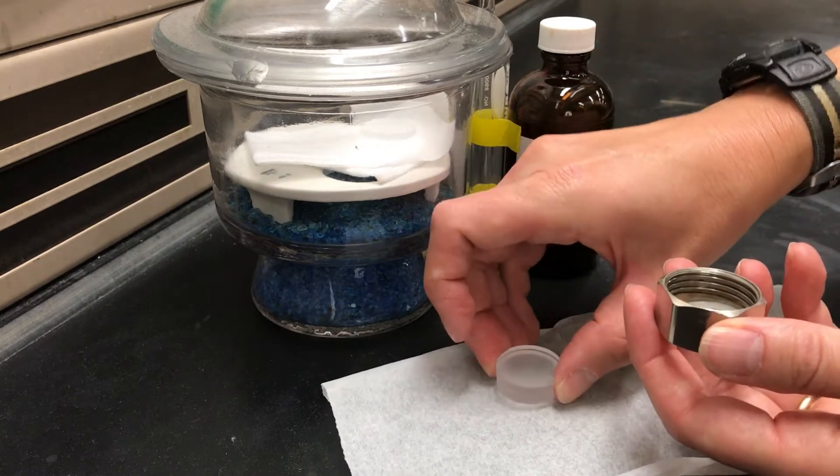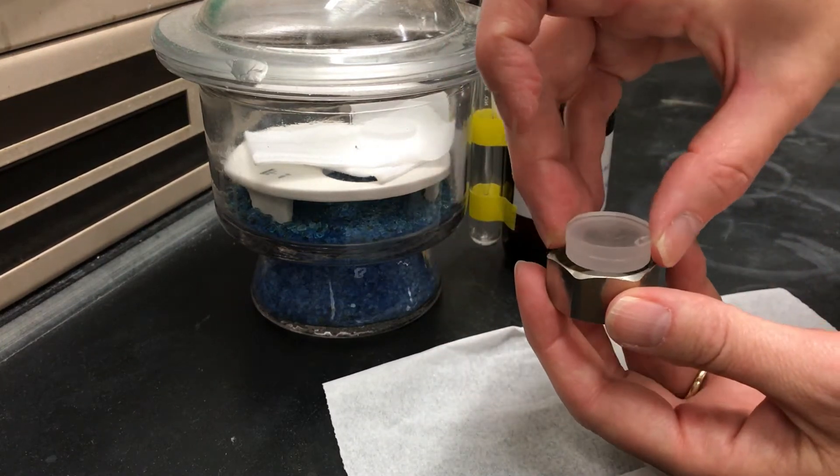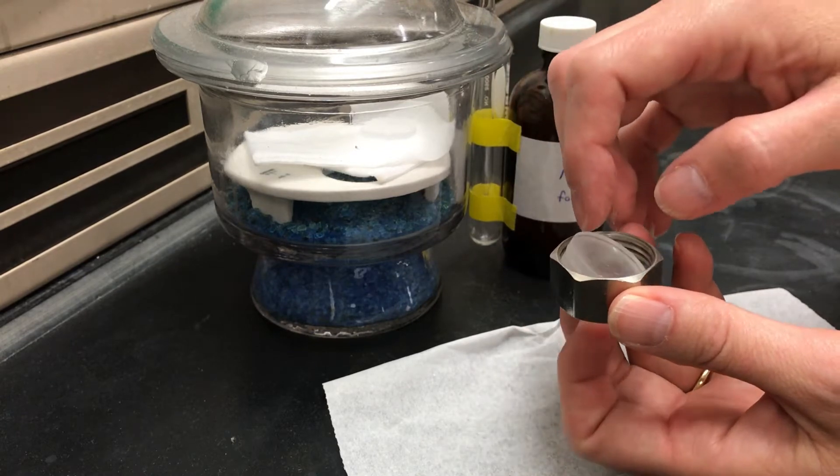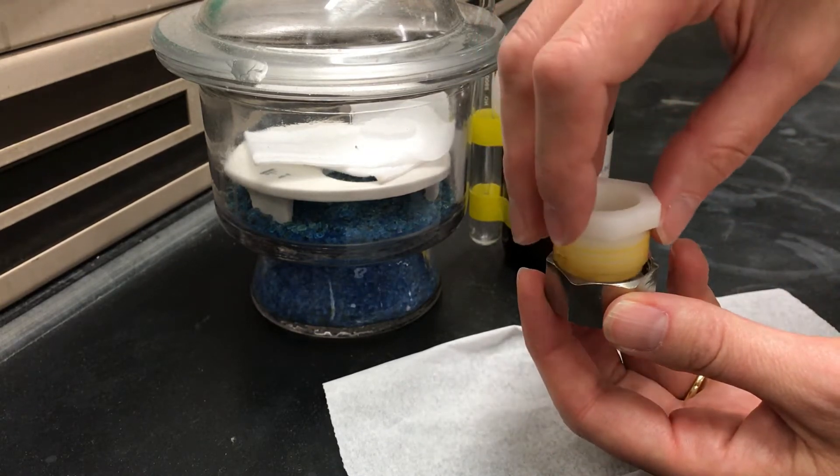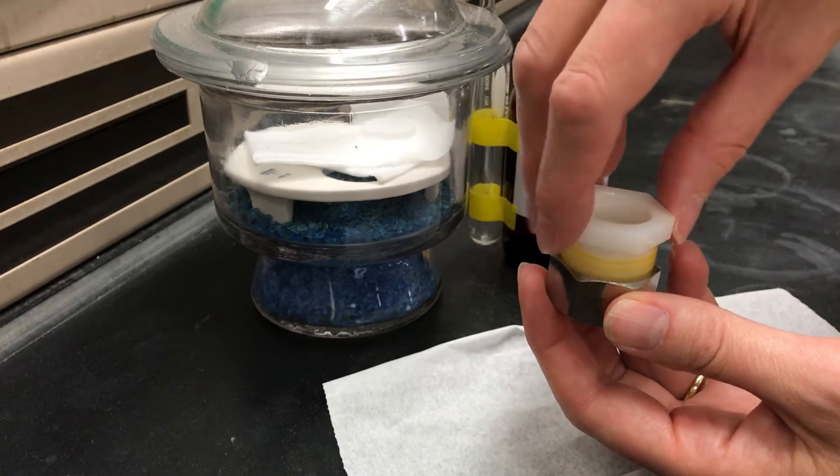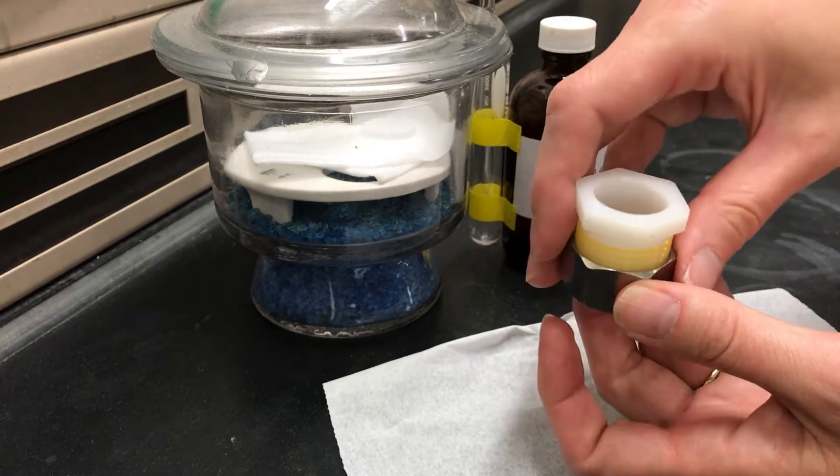You take that salt sandwich and you put it into the bottom part of a holder. Then the top part screws on and you want to screw it on so it's just barely tight. You don't want to tighten it too much or you might crack the plates.